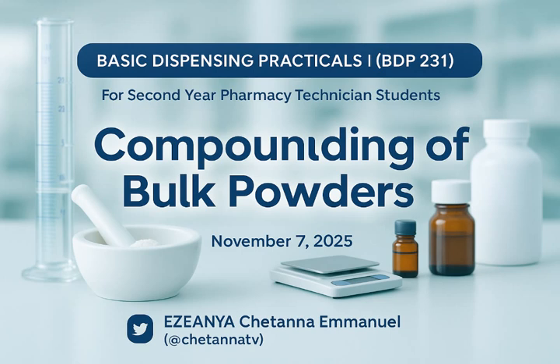Then let me just use this one as an example. Look, this one and this one are of the same quantity, right? Yes. Zinc oxide and this, so no need. What you need to do, just take 20 grams of this and this and put in what? Mortar. Okay? If you take 20 grams of this and this and put in mortar, you calm down because they are the same. You mix them properly.